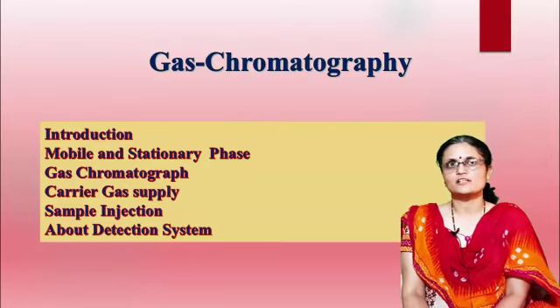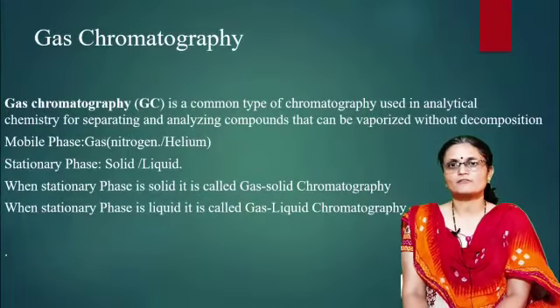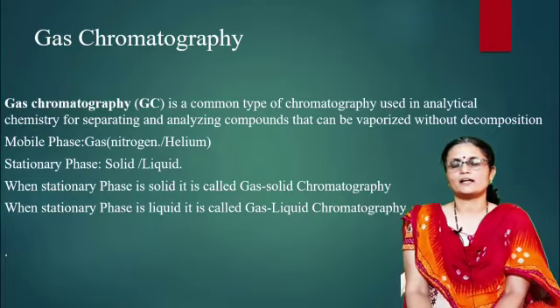We are going to discuss the mobile phase and the stationary phase in chromatography, a gas chromatograph, the carrier gas supply, the sample injection system, and the various detection systems in gas chromatography. Let us see what is meant by gas chromatography.